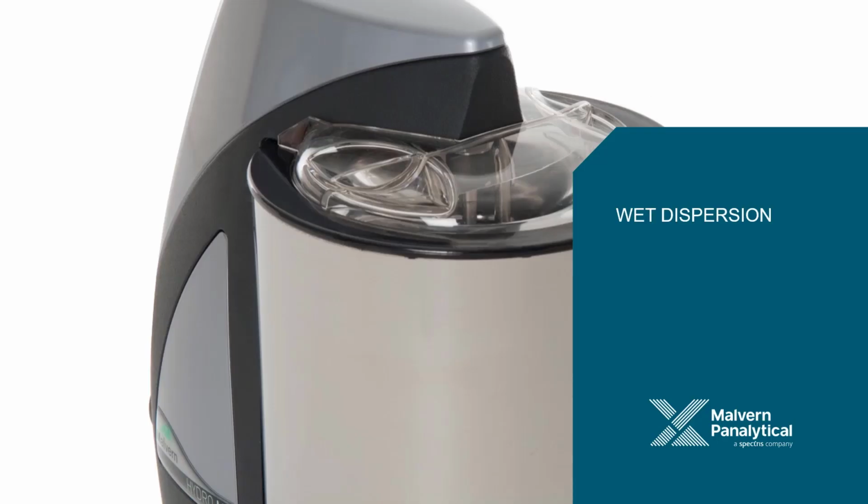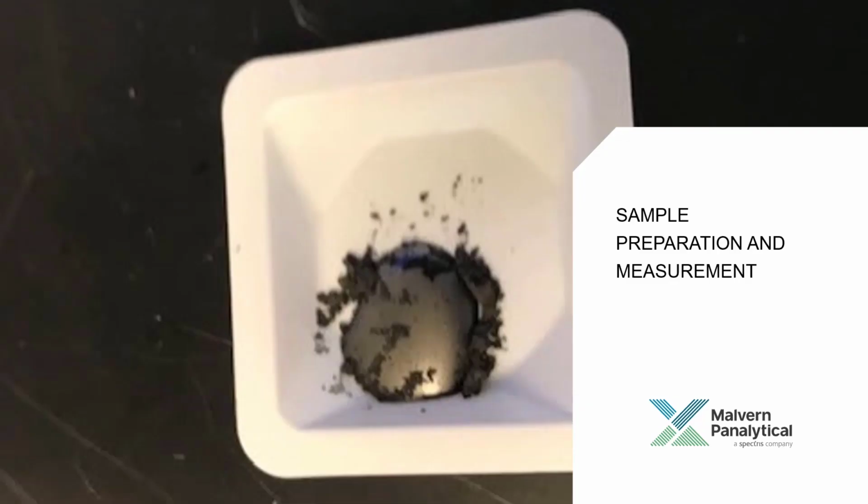So let's start discussing wet dispersion analysis with the Mastersizer 3000 and its associated wet accessories. We will start by first concentrating on the sample preparation and measurement steps. These depend on the sample type. Is it a suspension, an emulsion, or a powder? Always build your methods in manual mode so that you can learn as much as possible about your sample before locking in the method.